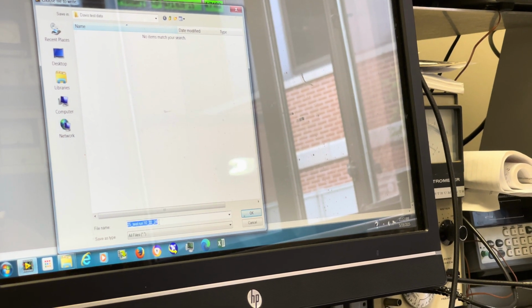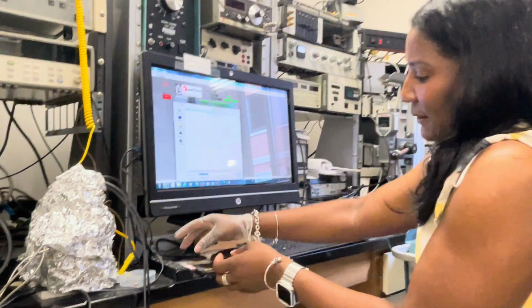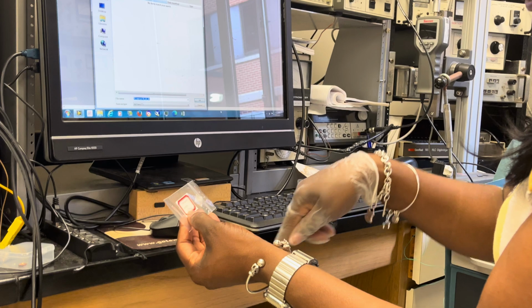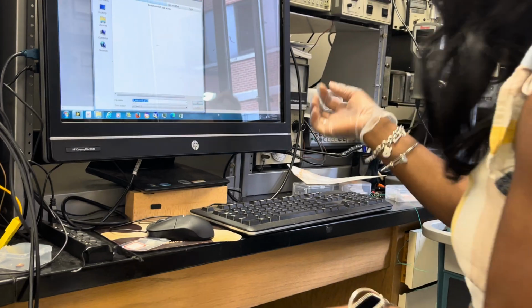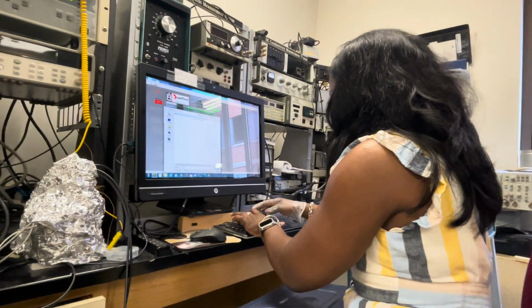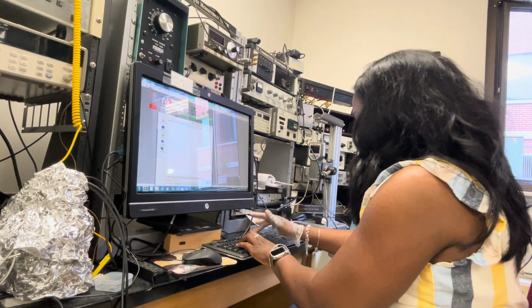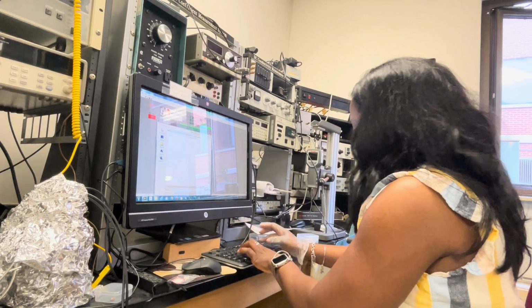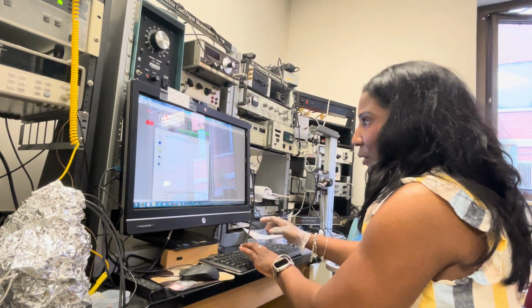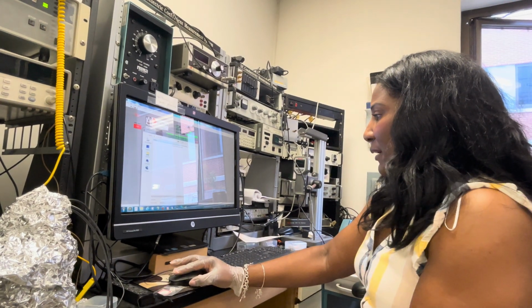But what's important to do is, because these measurements are temperature based, go ahead and put the temperature in the name. So for instance, this particular sample was my 0.7513 PVDF, 0.0456 calcium titanate. Now, I like to be specific, so I actually type all of that in the sample name, okay? So we've got 0.7513 PVDF, and then I would go 0.0456 calcium titanate, and then I would underscore it. Our temperature is set at 35, so I would put 35, and then I will hit OK.